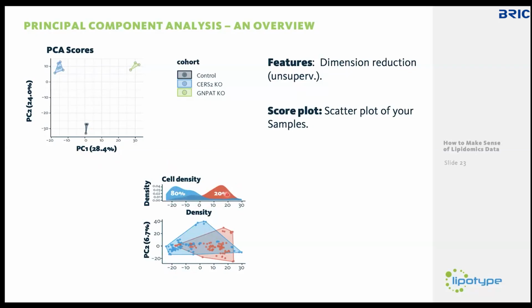That clearly said, okay, this is a major confounder in your data. And we ended up using only one density for the following experiments and not mixing them.